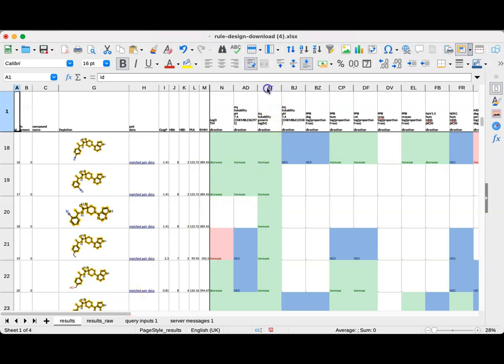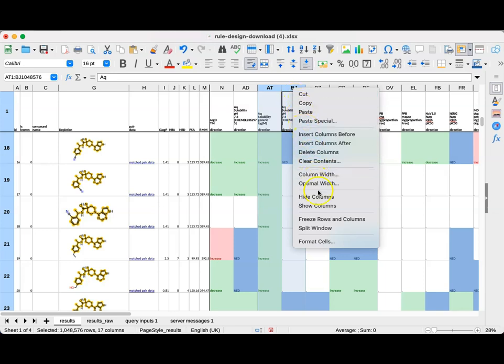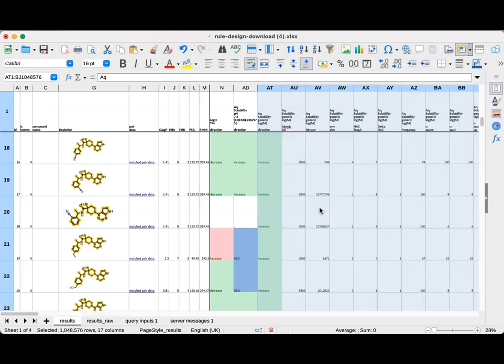So we grab some of the columns here with the NED data that we want to look into, and I'll just grab the next assay too. Once this data is unhidden, we can see the rest of the stats columns, and we can see the names are built up of the assay and the stats data it equates to.